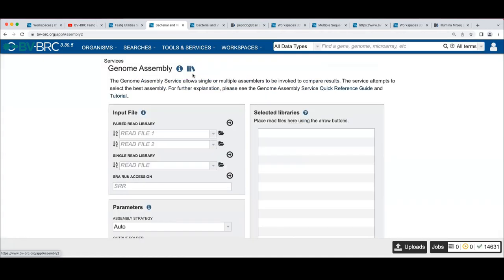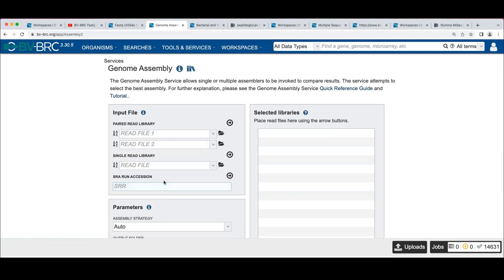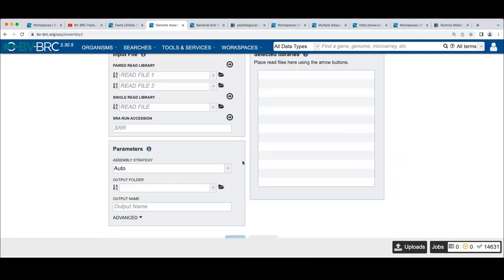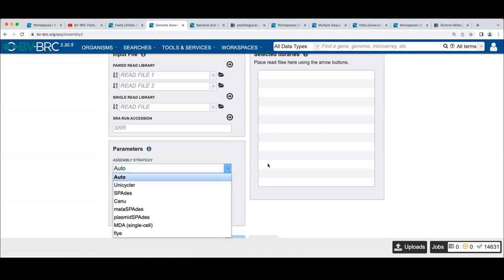If you click on the genome assembly service, you'll see an interface with options for single-end read library, paired-end reads, or a run accession — that works for SRR or ERR numbers from SRA or ENA. There are also assembly strategies: there's an auto assembly which runs Unicycler and decides the best strategy. I almost always use the auto recipe because a lot of work has gone into making it work well.